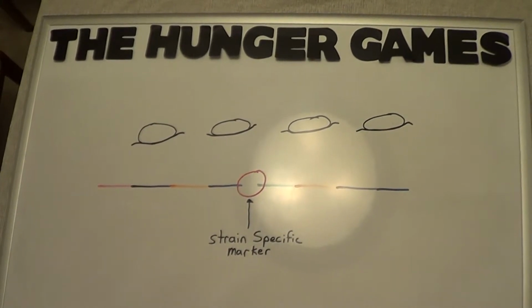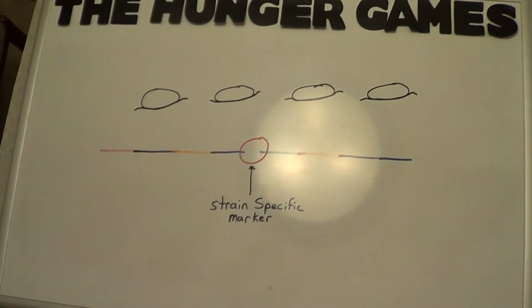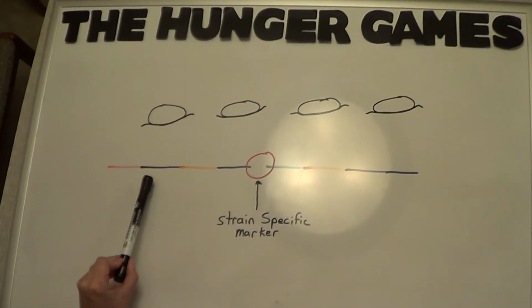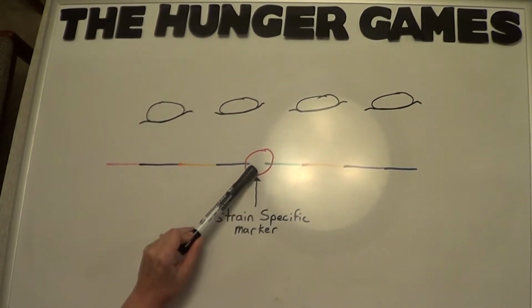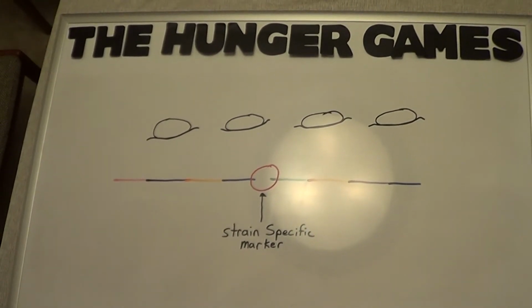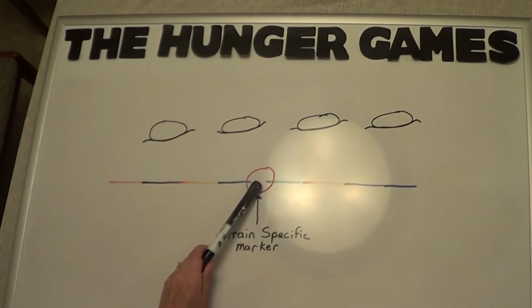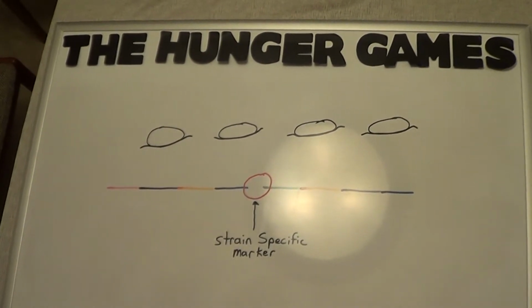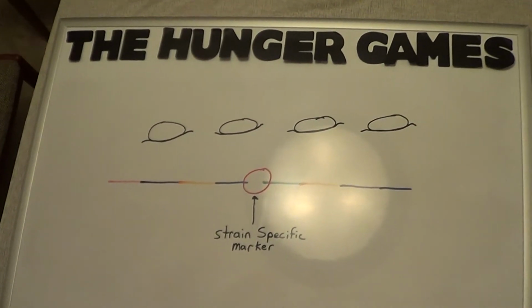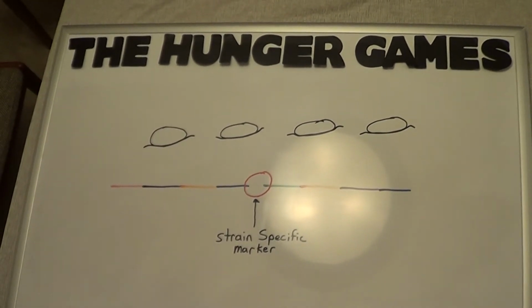During the DNA sequencing process, we used probes to run over the DNA strand of C. elegans to look for specific strain markers that would tell us that the strain is contained in the final petri dish of C. elegans. So in doing this, it would run over the strand of C. elegans DNA until it found that specific marker, and that would send a ping to the DNA sequencing machine, letting it know that the strain was there. Ultimately, after it was done running through, it would generate a graph for us showing the percentage of C. elegans contained on the plate.